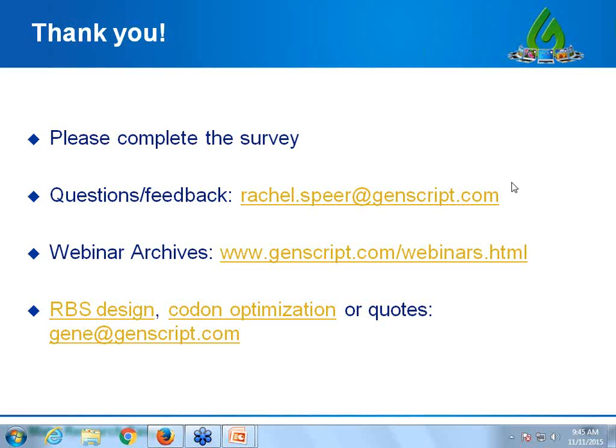Okay, so then, oh, I see, I'm sorry, there was a question that was asked halfway through that says, will the entire presentation be on expression in E. coli? I'm sorry that the RBS really was specific to E. coli, but codon optimization, section 1, and expression vector optimization, section 3, those really are relevant to mammalian or any other host system. So I hope that you found this useful, even if you're not working in E. coli. And if you have specific questions about non-bacterial systems, I'm absolutely happy to take those.